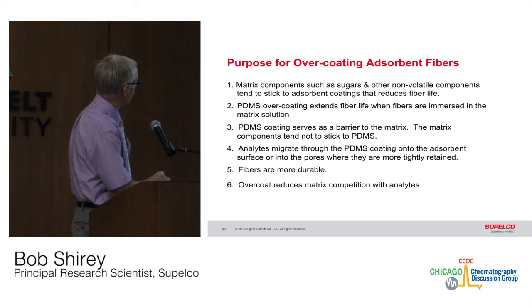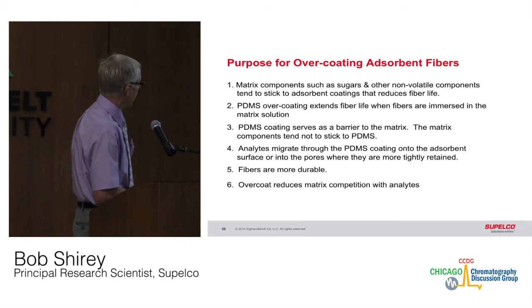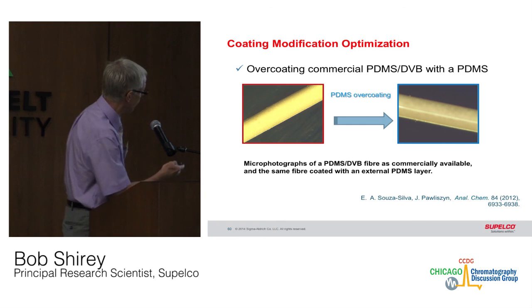So we put on a coating of a proprietary PDMS, which is a little more rigid, and that serves as a barrier to the matrix, and the components tend not to stick as much with this PDMS layer. The analytes migrate through the PDMS coating and are retained by the pores and the surface area of the adsorbent. The fibers are definitely more durable, and the overcoating does reduce matrix competition with the analytes. So it proved to be fairly effective. This shows the more translucent appearance from the PDMS overcoating over the fiber versus the non-overcoated PDMS DVB fiber.